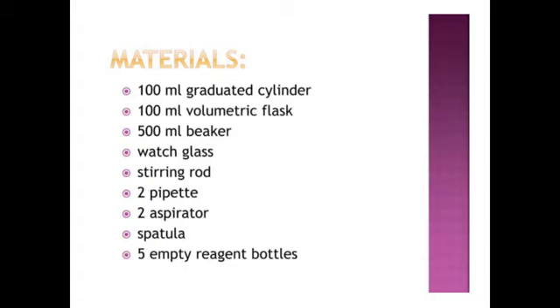You will need your pipette. Most of the time, you use it to measure the exact amount of water that you need, and sometimes you may even need a dropper if you need to add 1 or 2 drops to it. So these are the materials you need in preparing a standard solution.